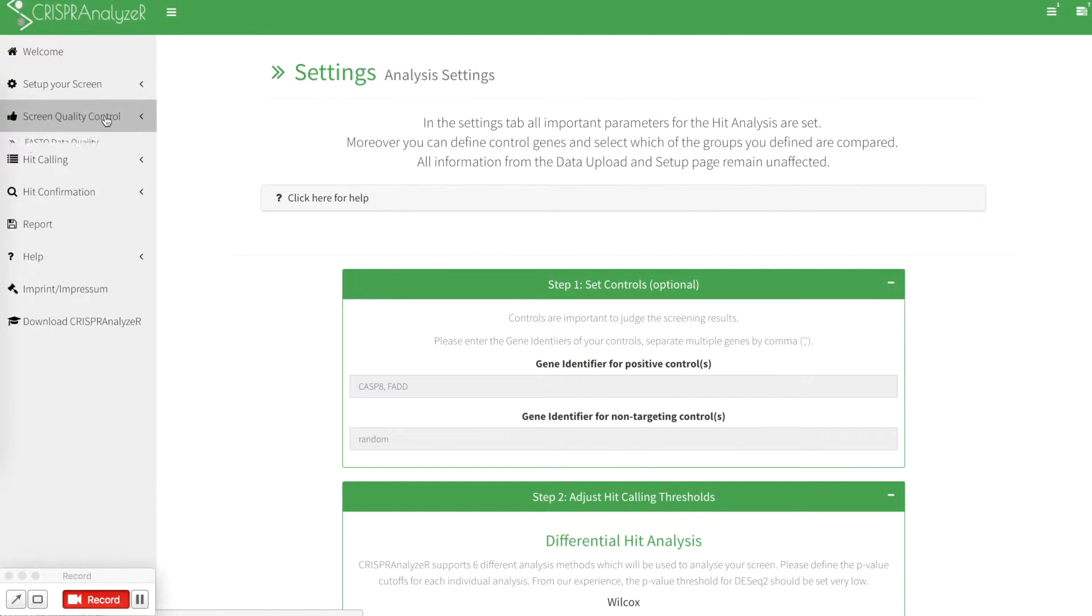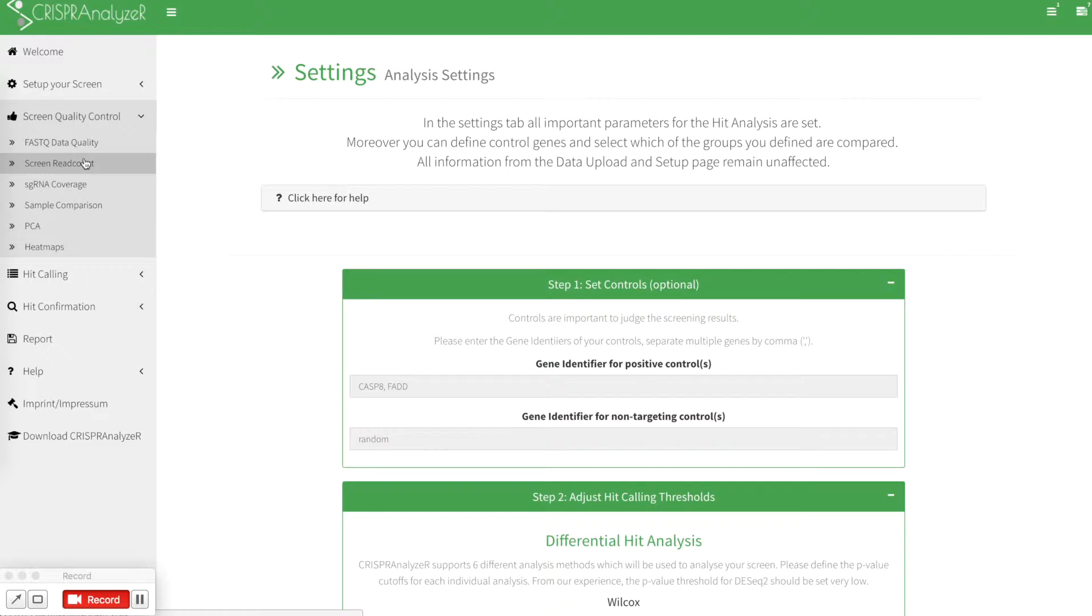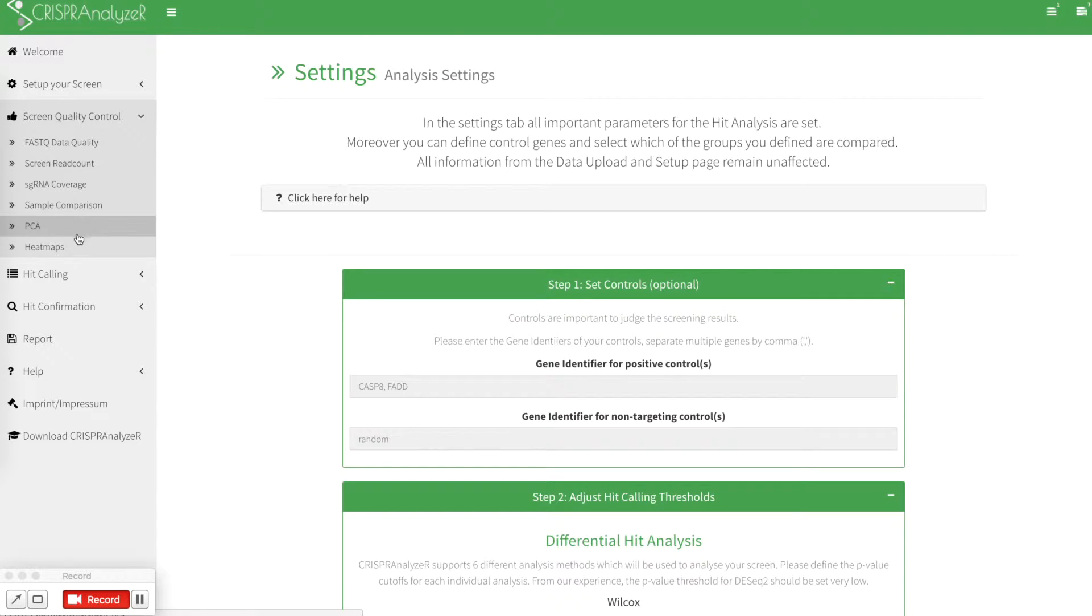You can go on for the screen quality control which offers features such as FastQ data quality control, overview about your screen read count information, sgRNA coverage, a sample comparison, principal component analysis and heat maps using different visualization features.